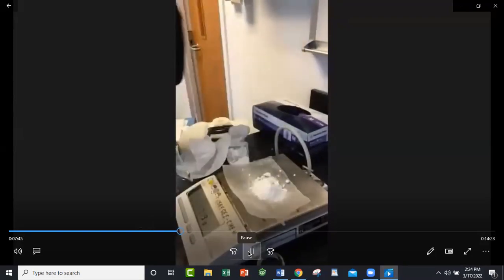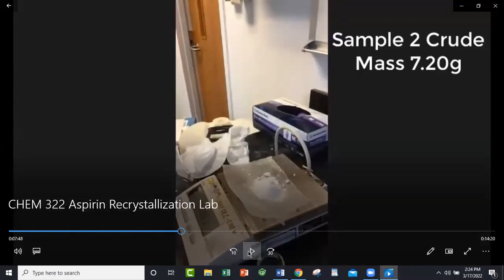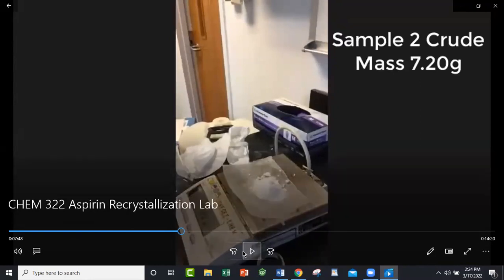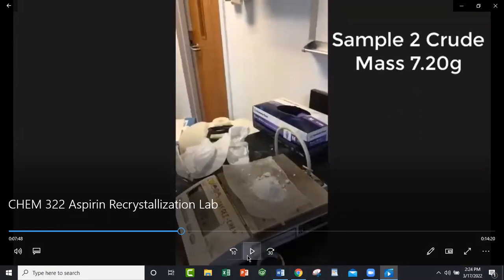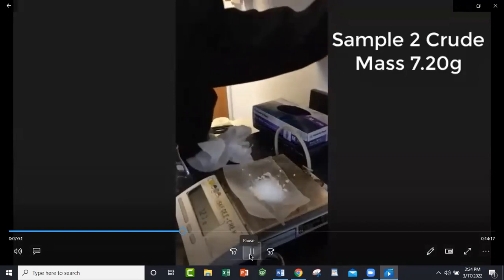All right. So that second sample. Sample two is 7.20. If that's the sample that you want to use, then you can record that number for your crude mass. It's 7.2. This is yours, Malachi, 7.2 grams.